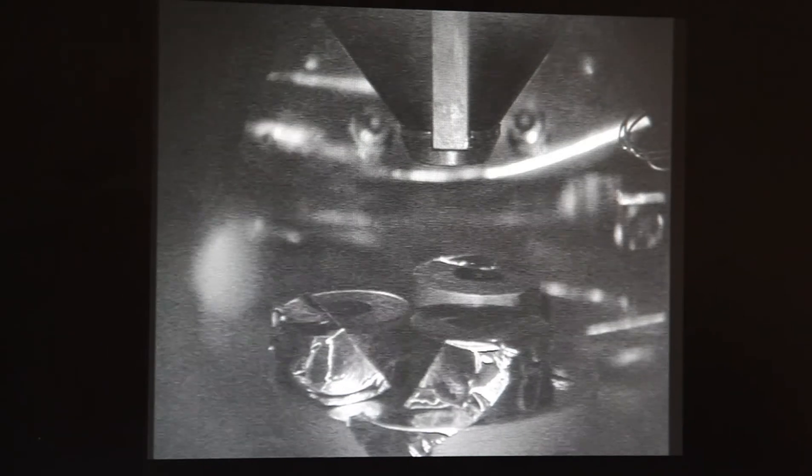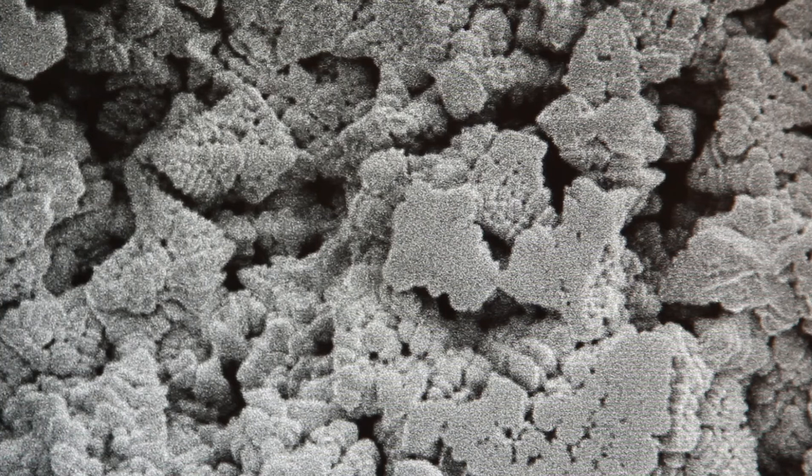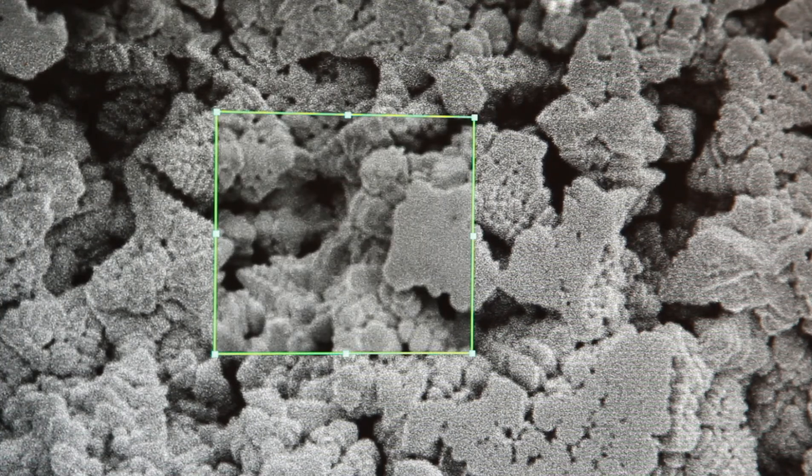A focused electron beam scans the sample surface to create an image, producing various signals that can be used to obtain information about topography and elemental composition.